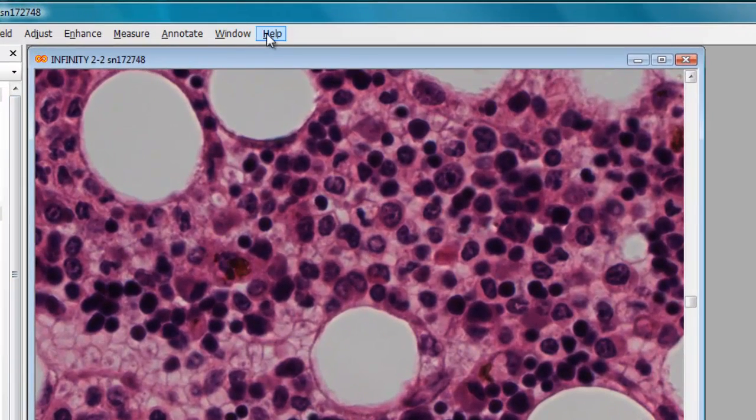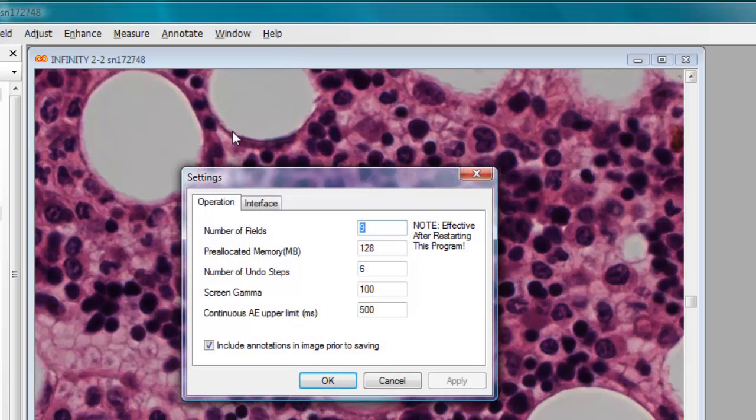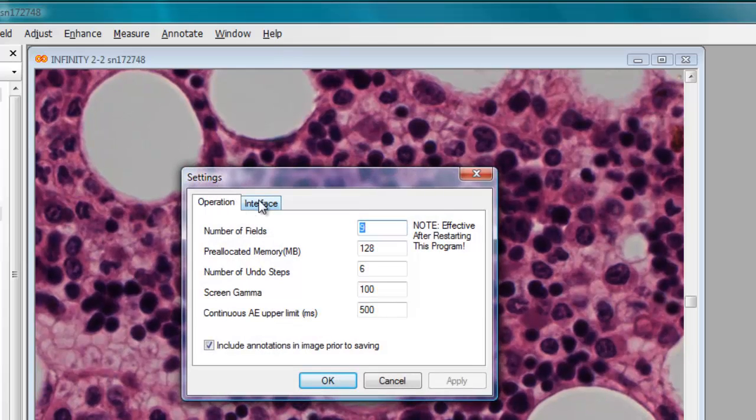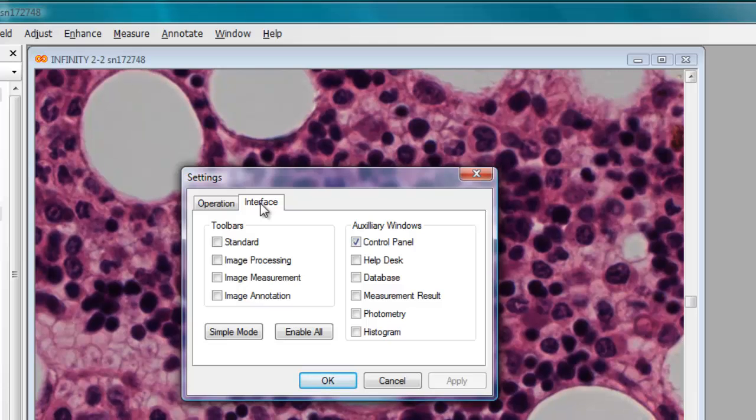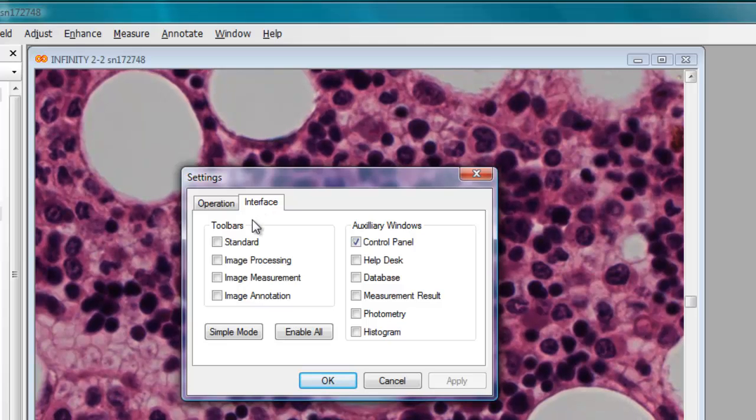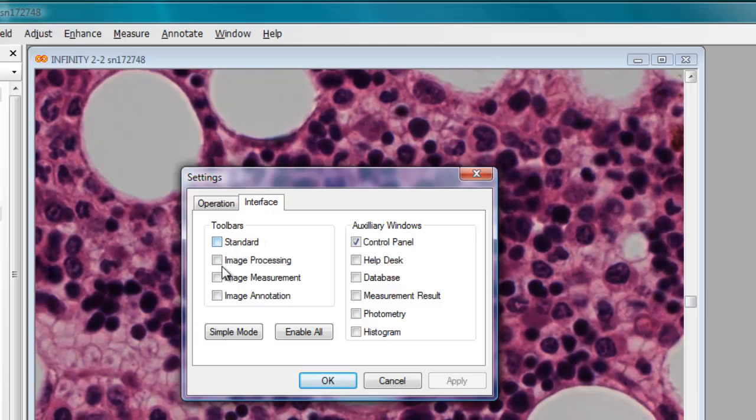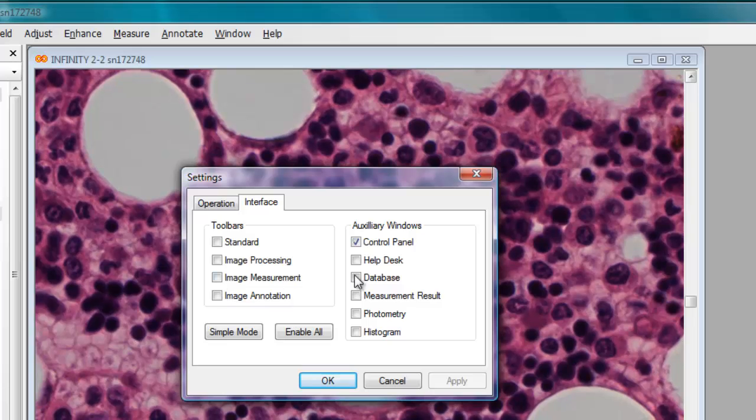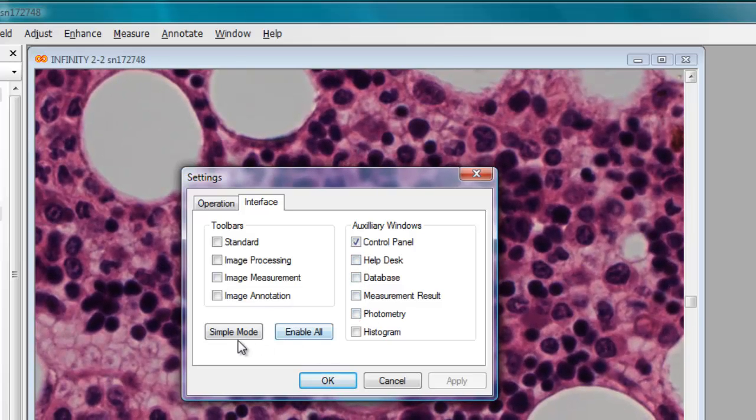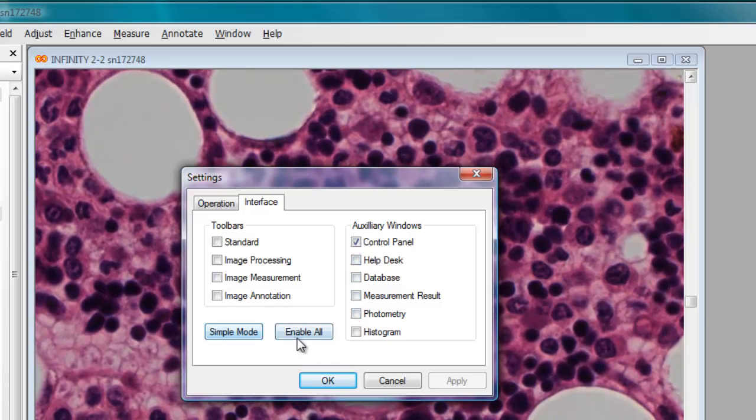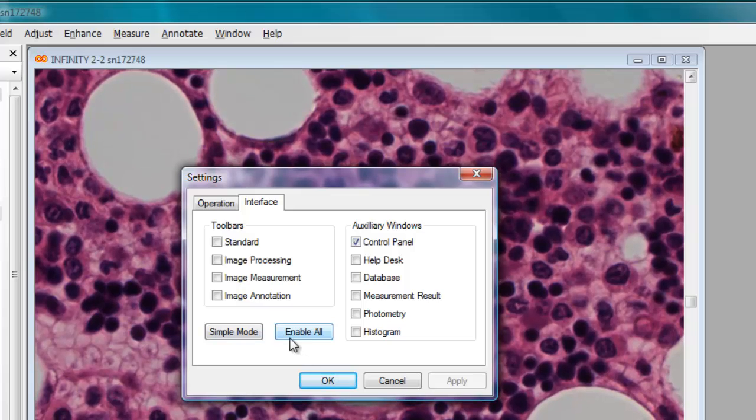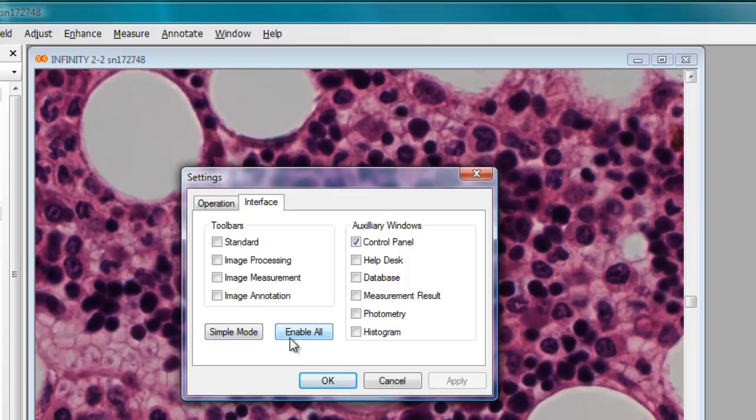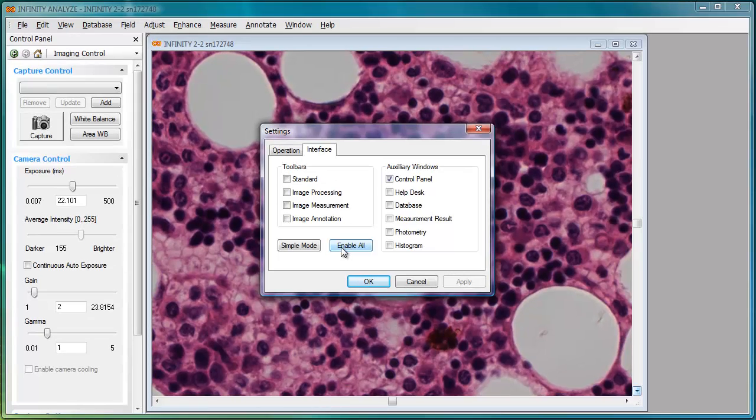Let's begin by looking at the help settings menu, where with 6.0 software we introduce the new interface tab. The interface tab is a nice way to access the toolbars and auxiliary windows functions individually, but you can also toggle directly between simple mode and the enable all function, which turns on all of these options.